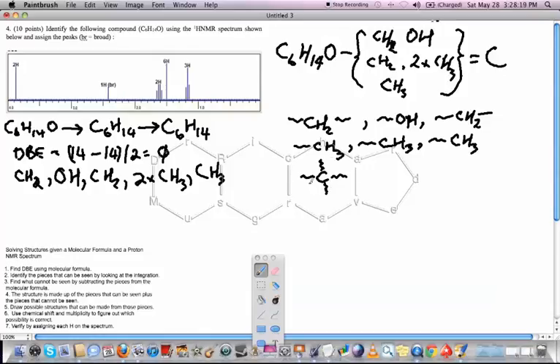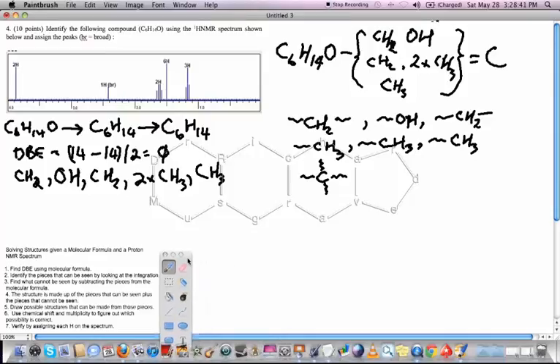And additionally, we know this carbon is not connected to any hydrogens, because if it was connected to a hydrogen, we would see it somewhere in this spectrum. Alright, so now we have to come up with structures that contain all of these pieces and also obey the data that we're seeing in the proton NMR spectrum. So what we might do is just come up with a few structures and see if any of them match up to what we're talking about.